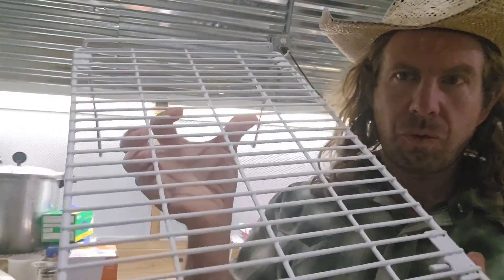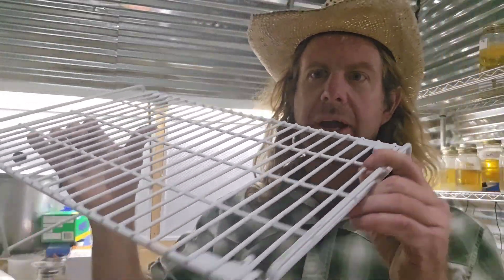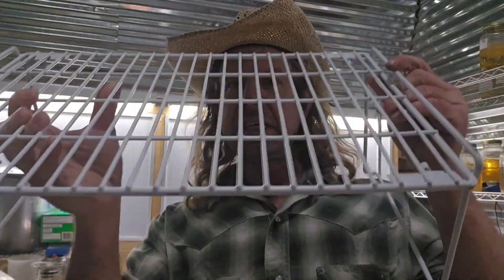Number seventeen: racks. I like these work racks to work on in front of the flow hood — we've got racks on racks on racks here. Get yourself some racks, number seventeen.